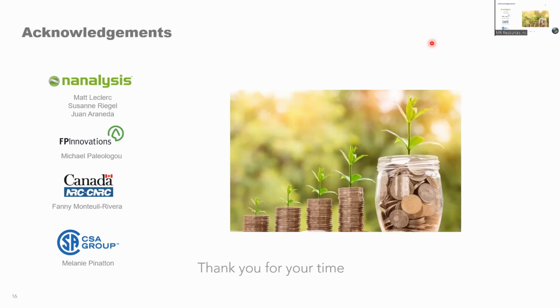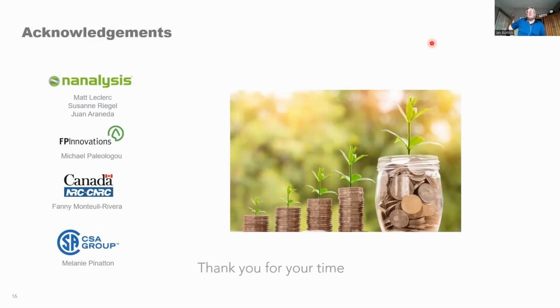Questions? I had a question about the stability of the phosphorylated samples. Can you talk a little bit about the sample prep and whether or not you use a J. Young tube or something so the sample would stay water-free longer? Yeah, so the samples and the reagents are all stored under desiccant in vacuum desiccators.